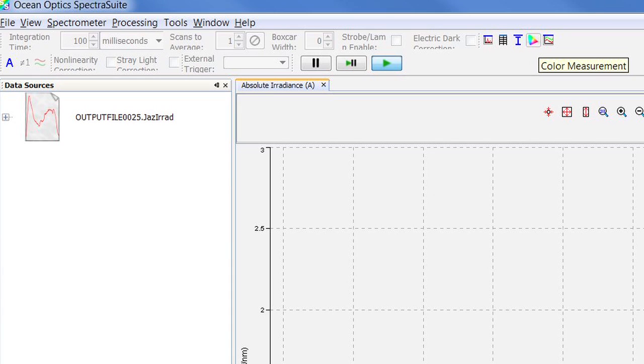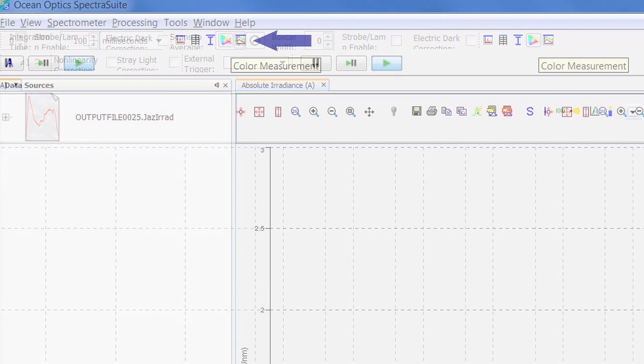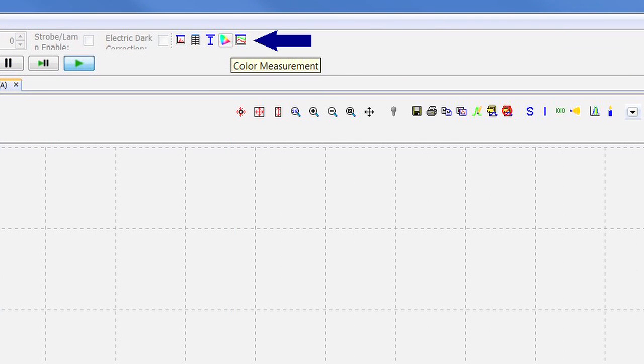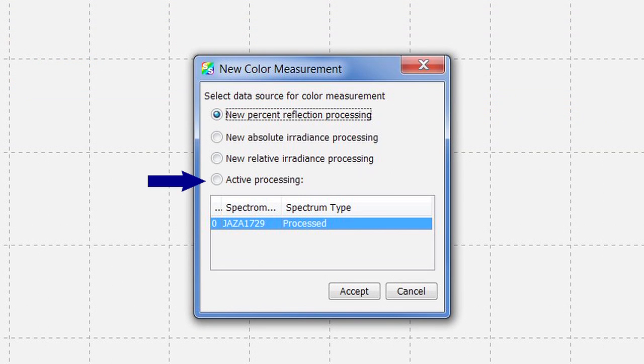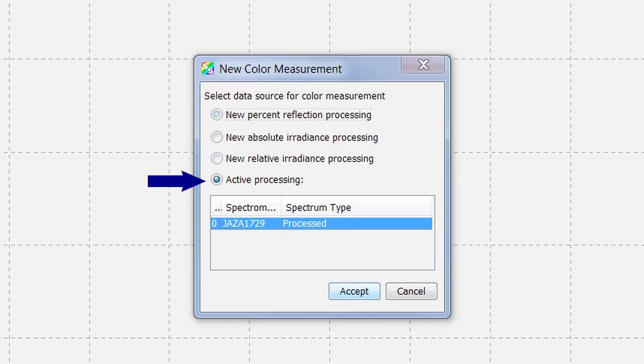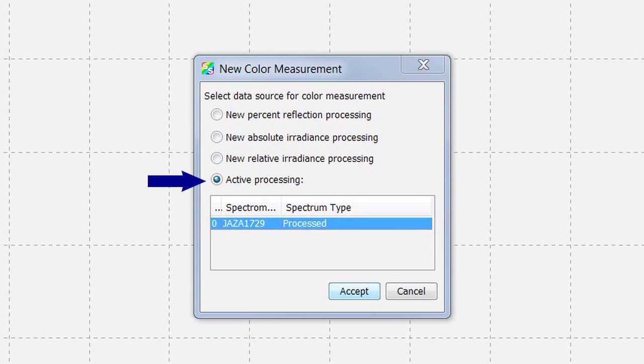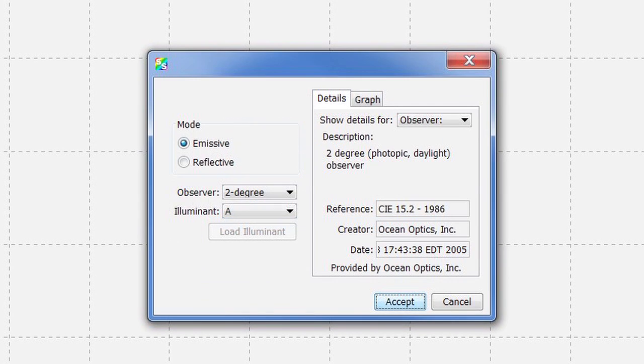Now we'll demonstrate how to start the color measurement processing. Click on the color measurement icon on the top toolbar. Select Active Processing and Accept. If you have multiple files open, you must select which processing source file you wish to acquire. It's best to work on one process file at a time.